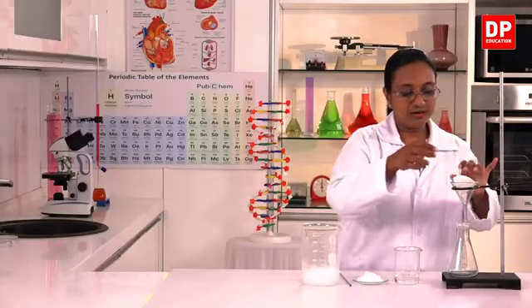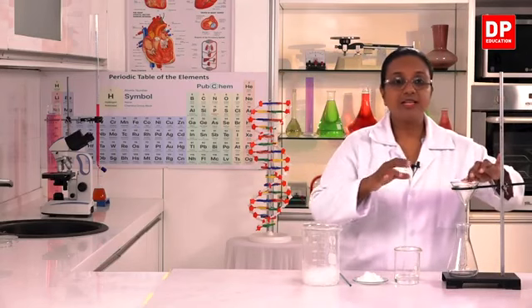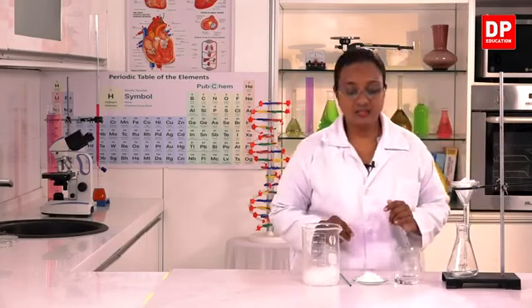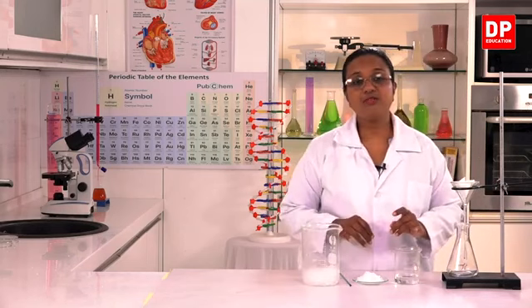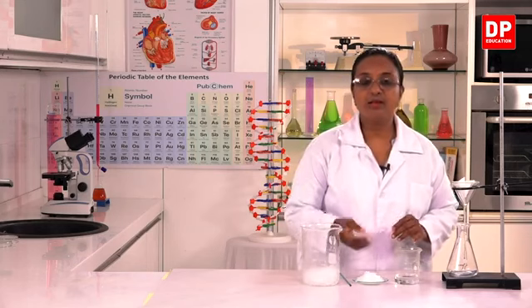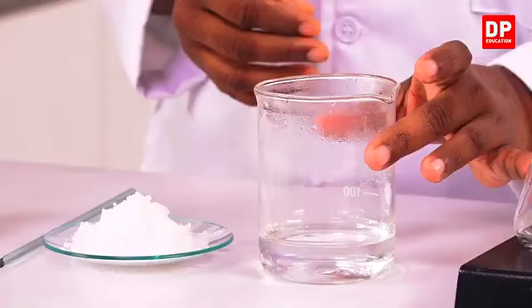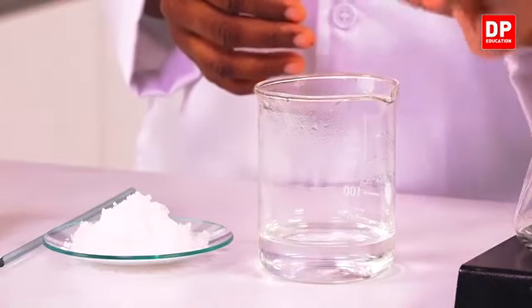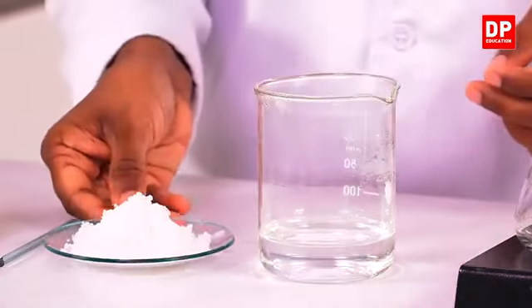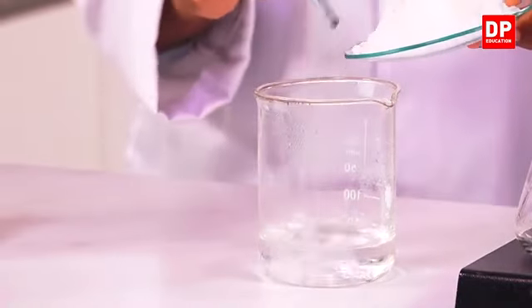And also, I have already set the conical flask here so that it is easy for me to transfer the solution. So, the solution will be sodium chloride, that is the common salt, but here we have the crystals of salt, and I am going to dissolve that in hot water. This is about 90 degrees in temperature. So, to this I am going to add the salt and dissolve it.